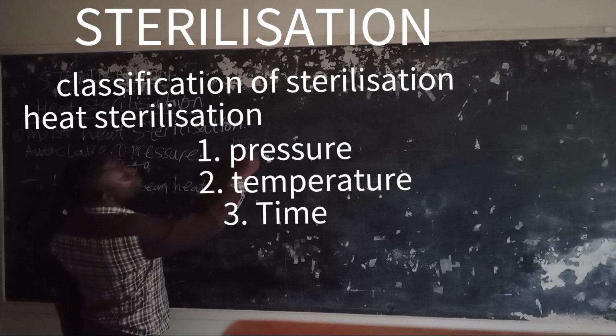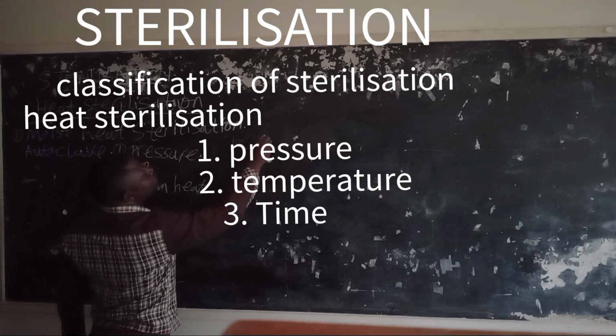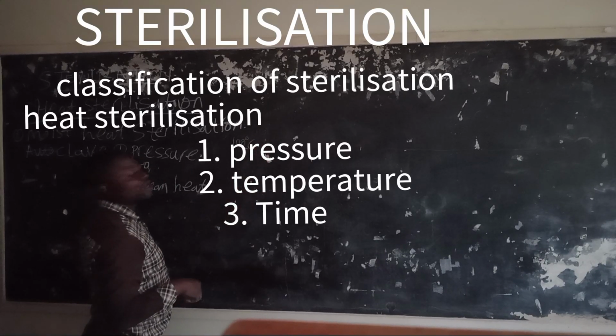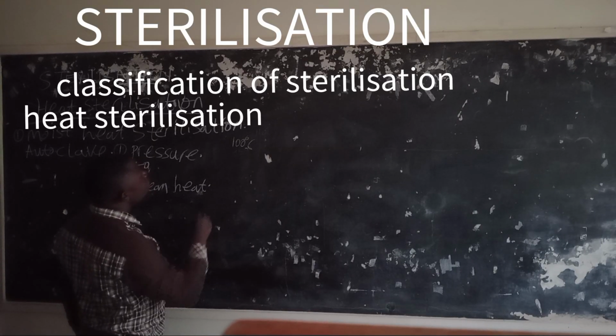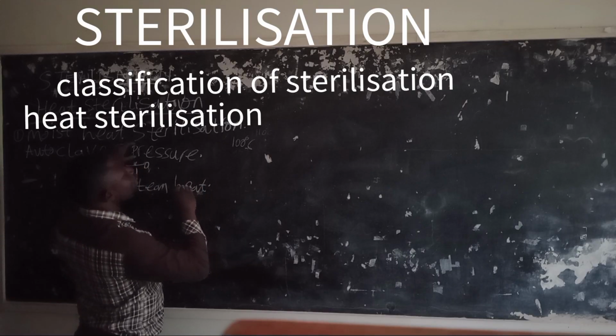Some may still be alive at 110 degrees Celsius. What we do is to increase the pressure.